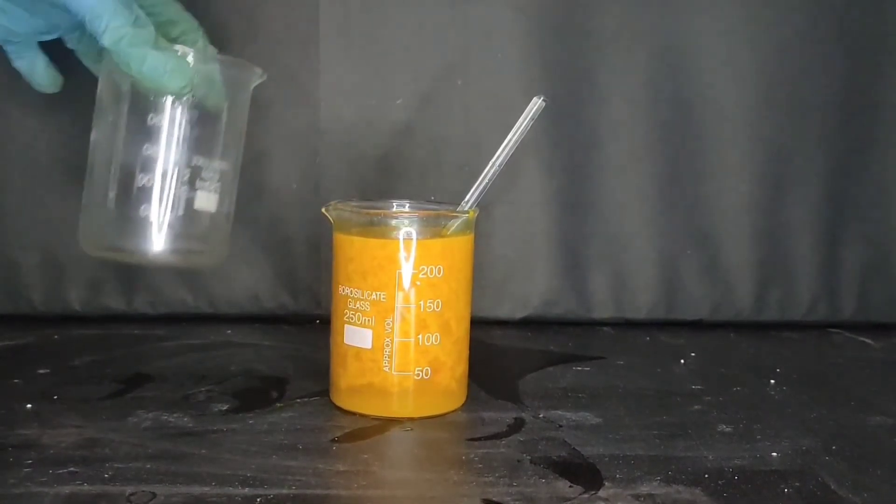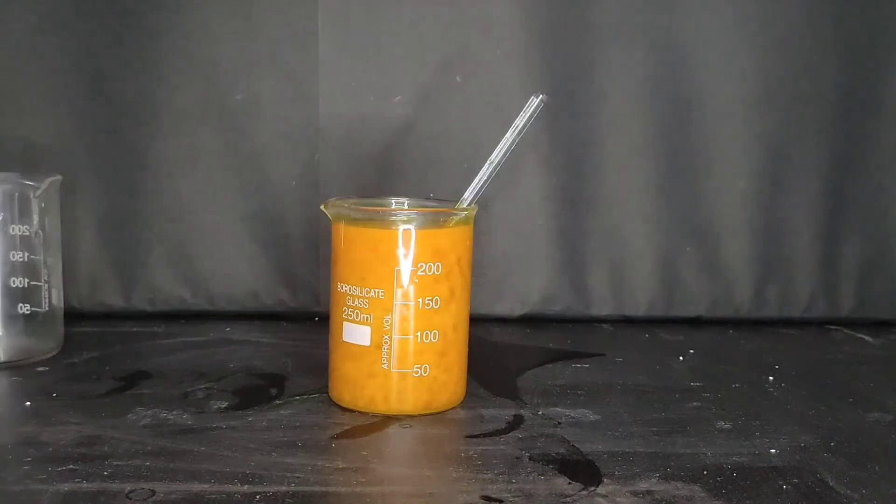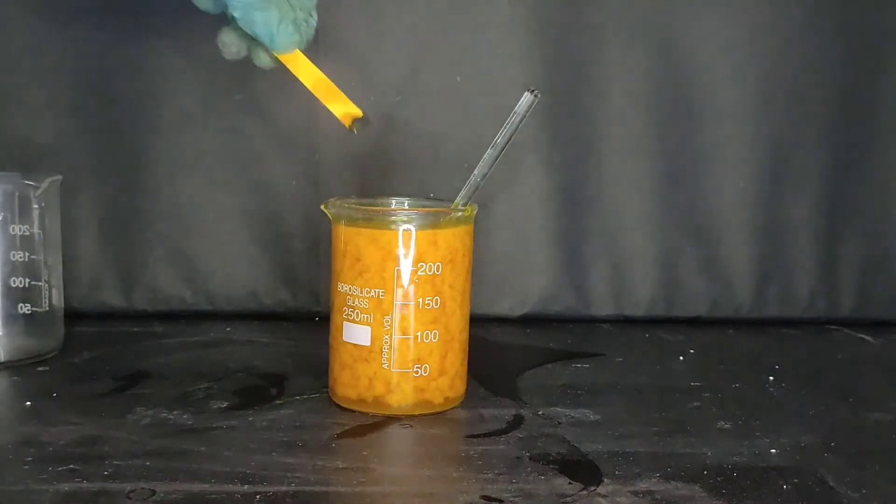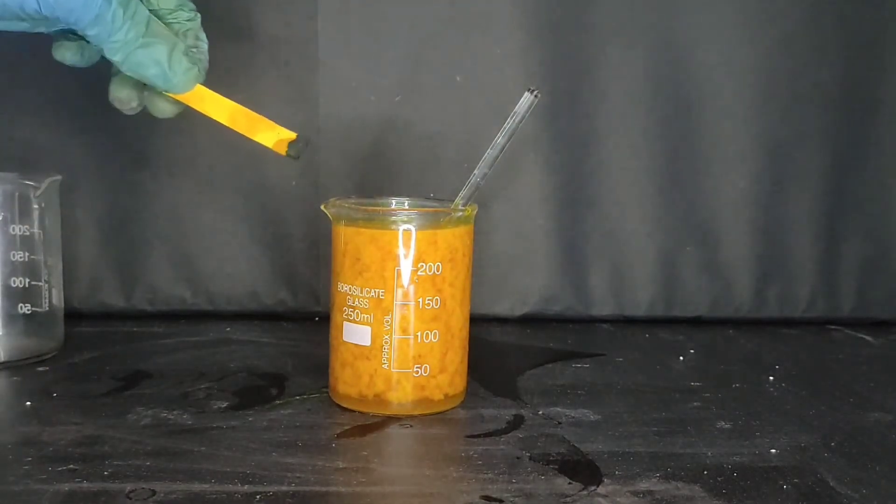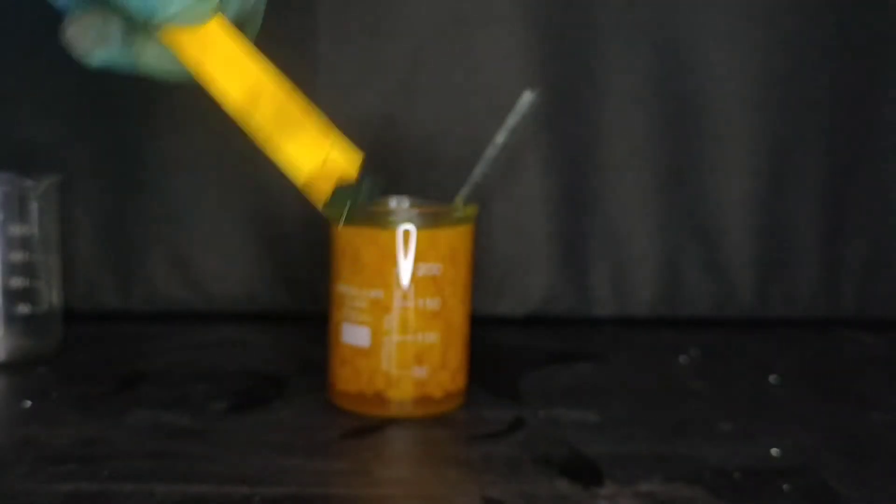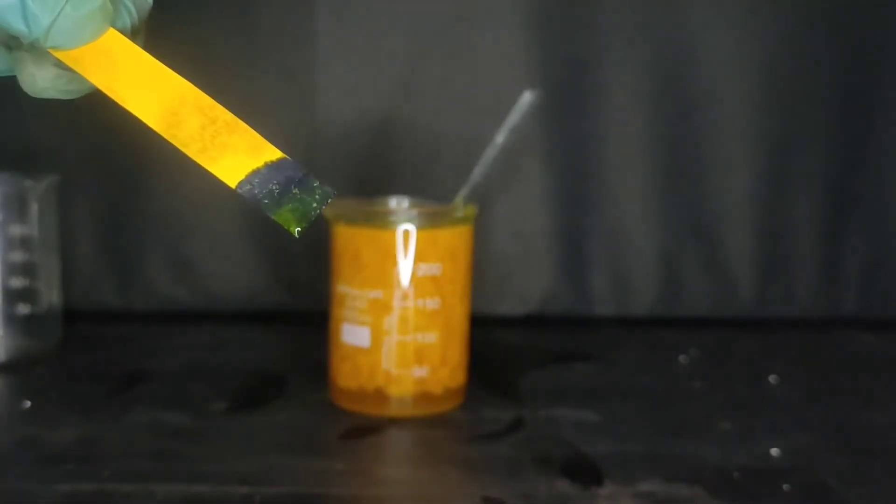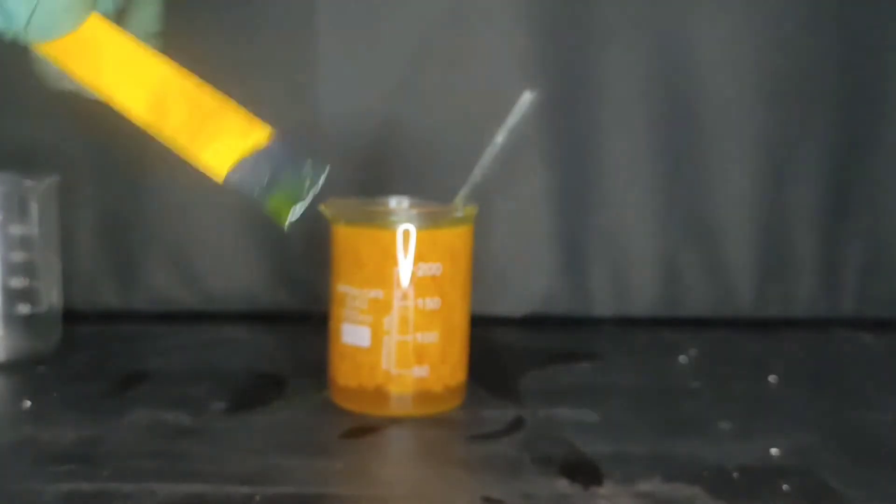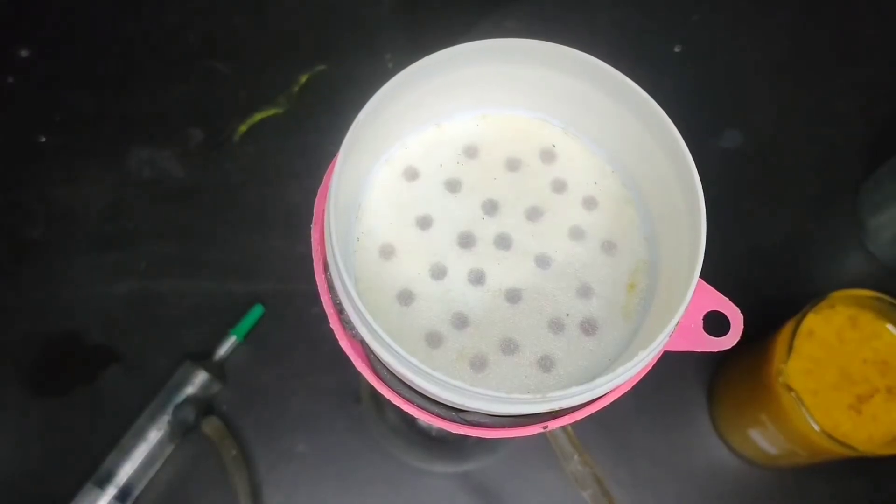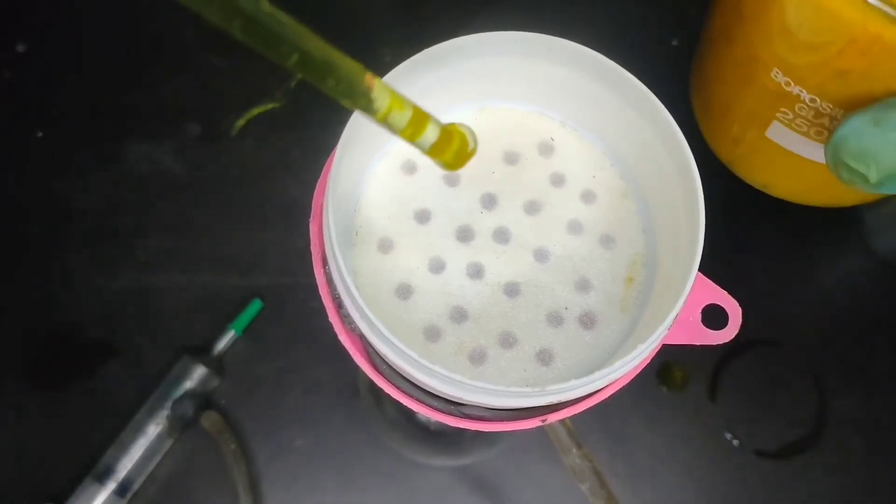I am adding some more 5% sodium hydroxide solution that I had, and then I will check the pH of the solution. You can see that the pH of the solution is highly basic, which corresponds to the pH of 13 or 14. This precipitate was filtered off using vacuum filtration.